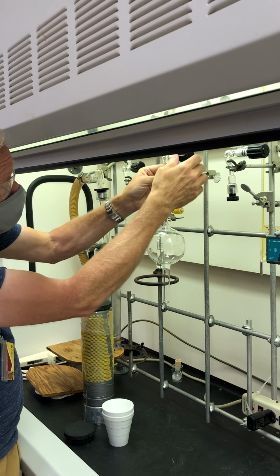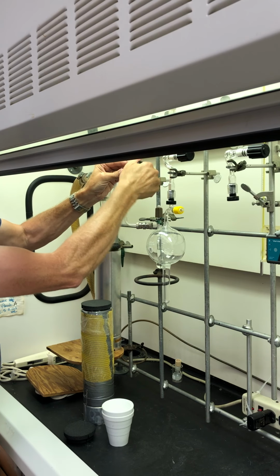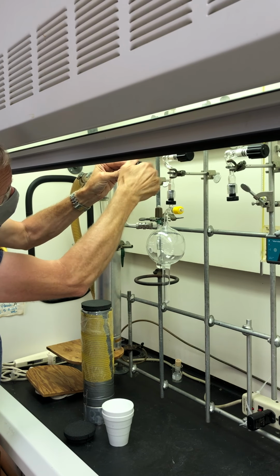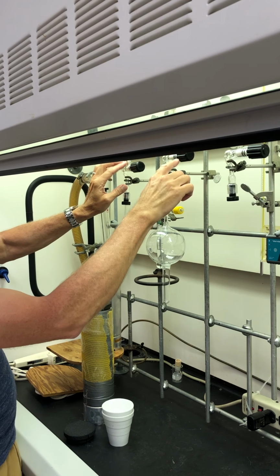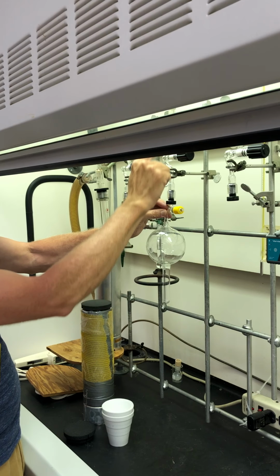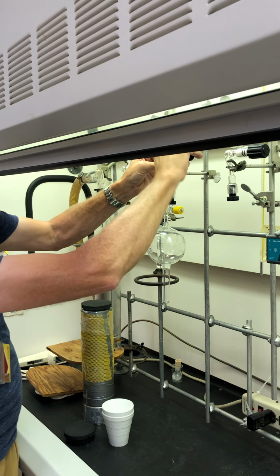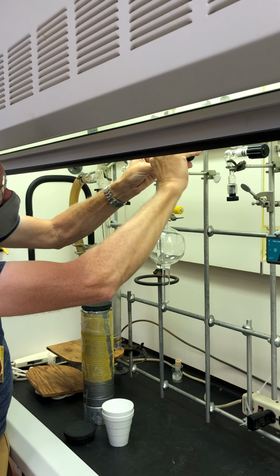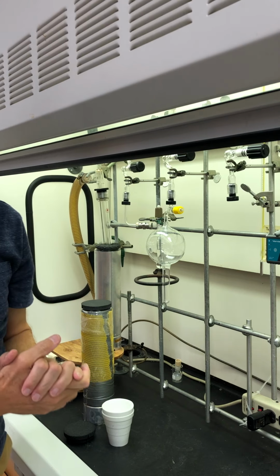And now I have air in here, and if I close the other valves, I can pump this air away because I can open valve B, and the air that's between this valve and this one will get pumped away. So I'll demonstrate that. Okay, and then that allows that air to be pumped away.